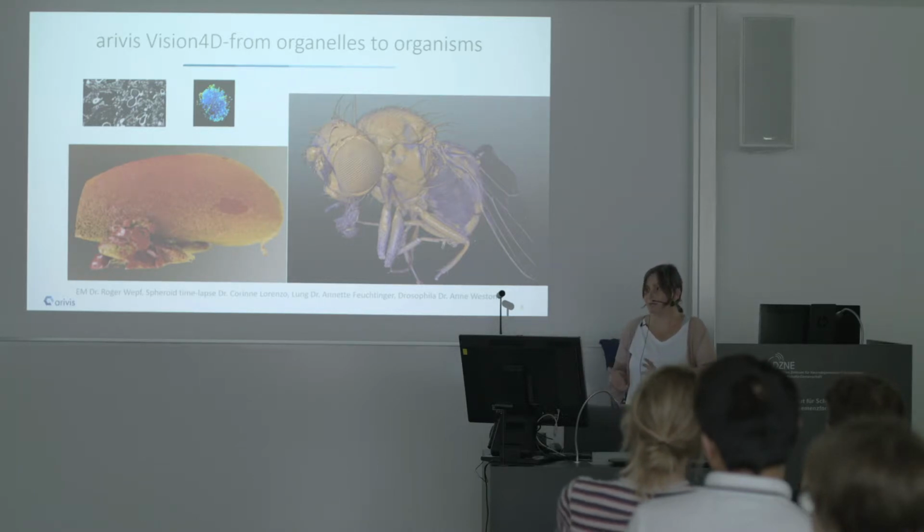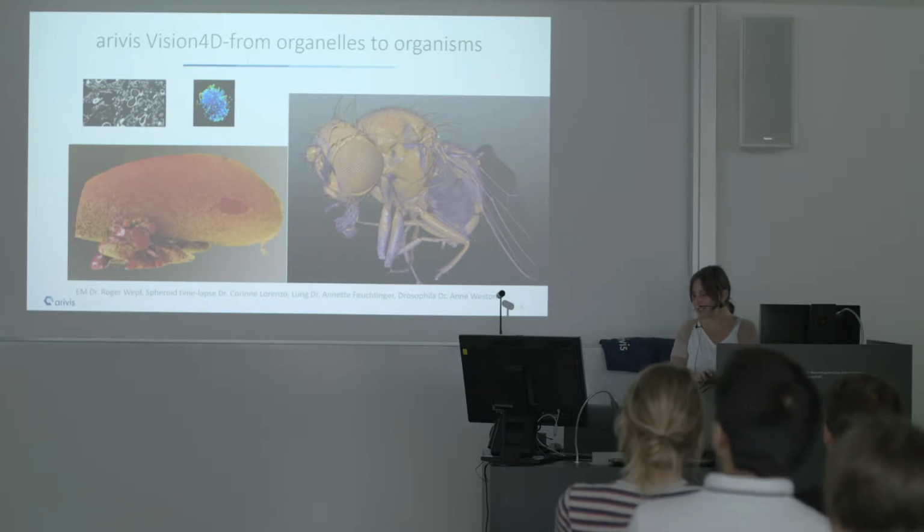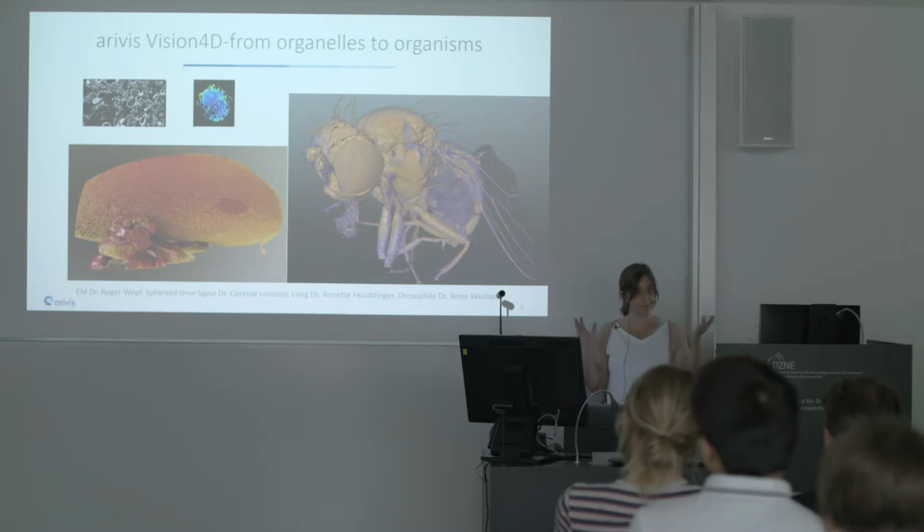But you can also apply, of course, the same software tool to other questions and modalities. And these are now screenshots and an animated movie created in Vision 4D, simply showing you the bandwidth of modalities. You see here, for instance, a very nice Drosophila with a color mapping.